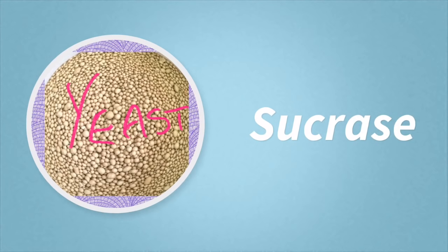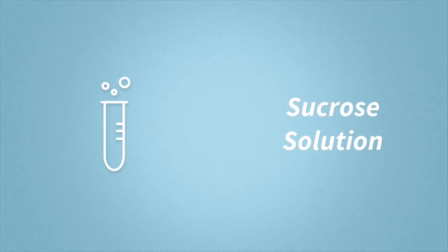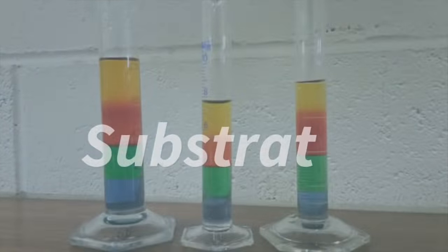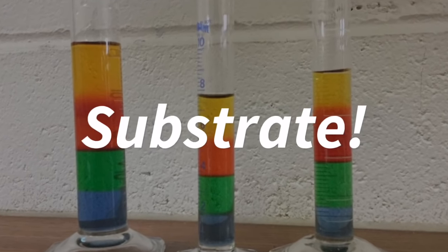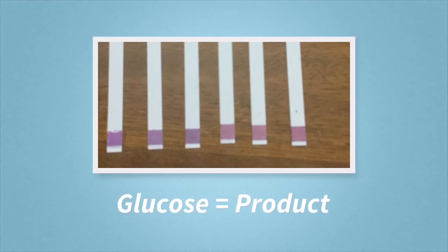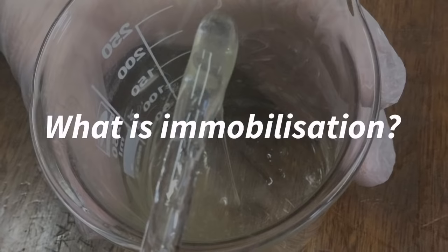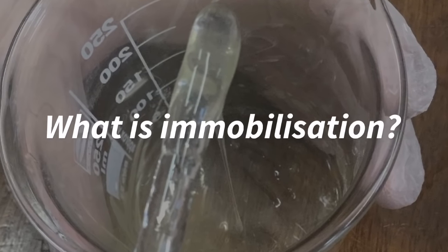In this practical, yeast was used and yeast cells contain the enzyme sucrase. Sucrose solution was also used. The sucrose acted as the substrate and the substrate was changed into glucose, which was our product. So what exactly does immobilization mean?